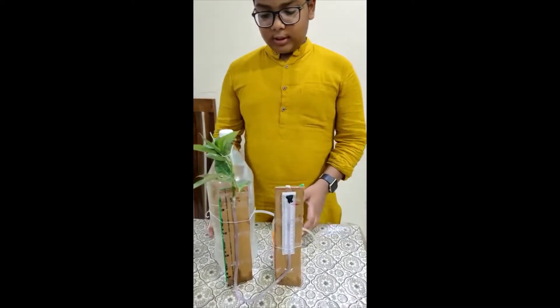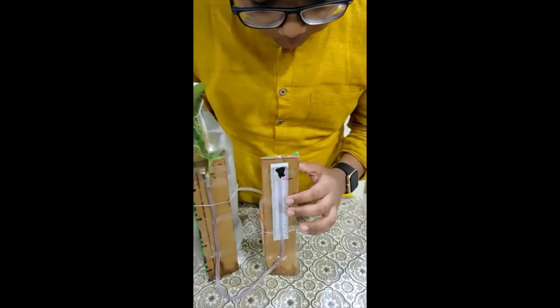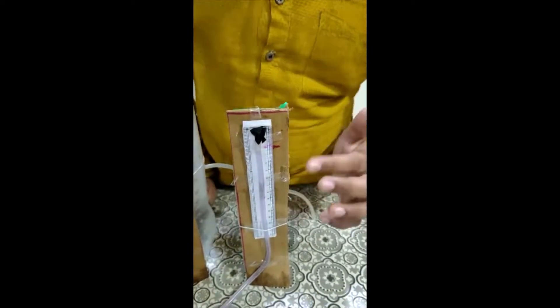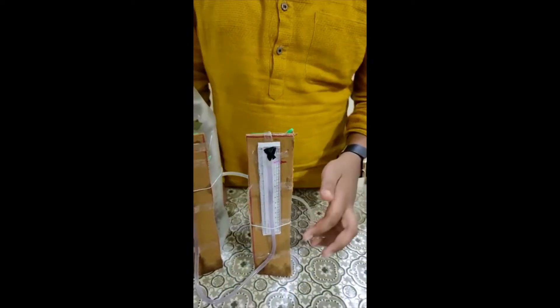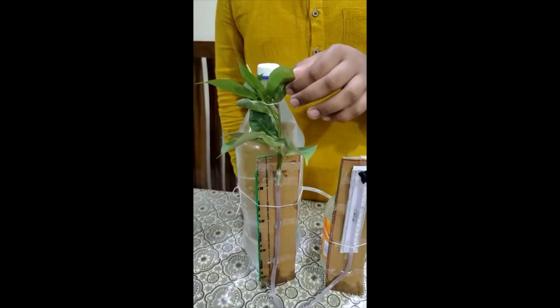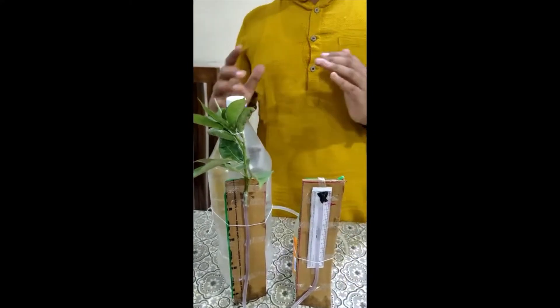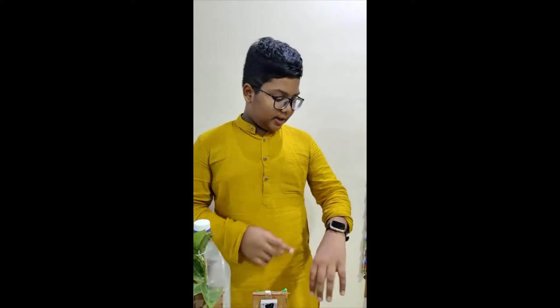As you can see in this potometer, we have this tube here with water, with the initial water marked at 2 cm of the scale from the top. This colored water is going here into this plant. So after some intervals of time, say half an hour, we are going to be checking how much water has been taken by the plant. Let's set the timer and wait.